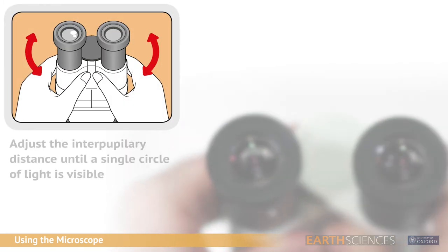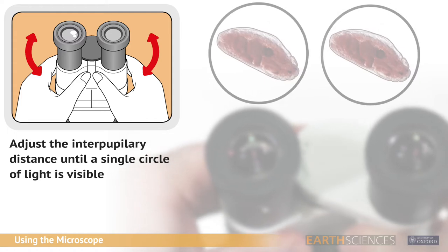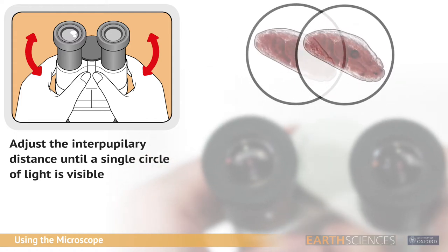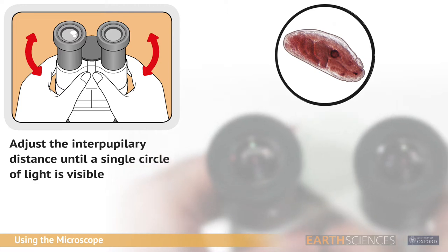Next, you need to adjust the interpupillary distance. If you look through the eyepieces and see two images, the interpupillary distance is not correct. Slide the eyepieces closer together or farther apart until the two fields merge to form a single circle of light.